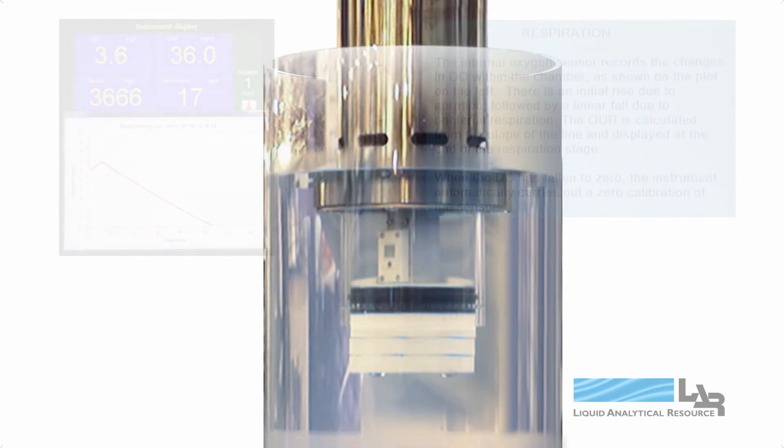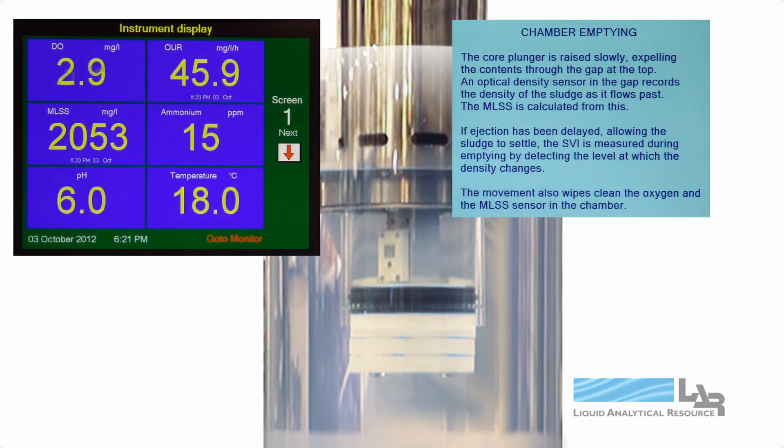When the dissolved oxygen has fallen to zero, the instrument automatically carries out a zero calibration of the sensor.